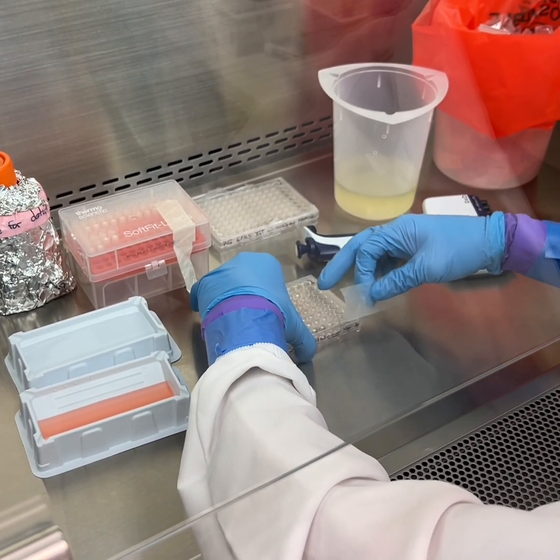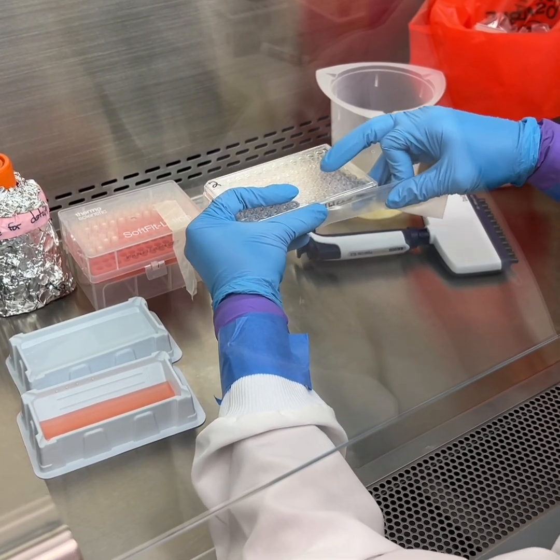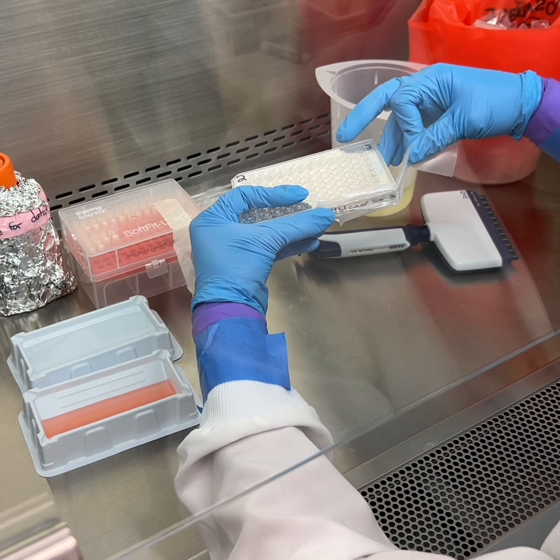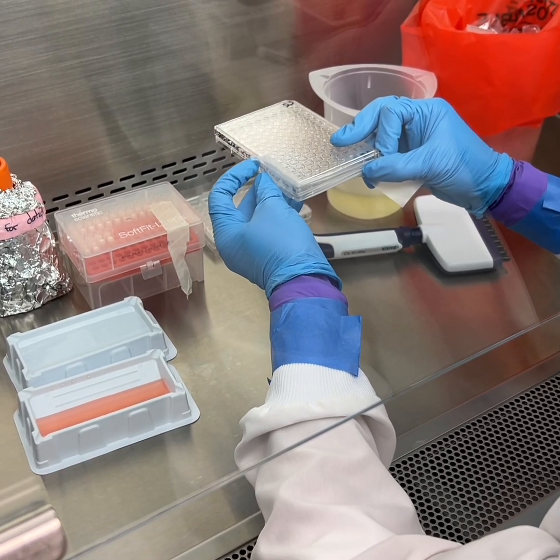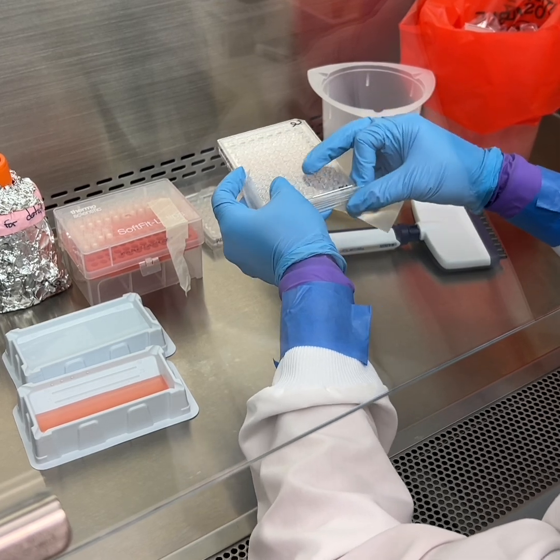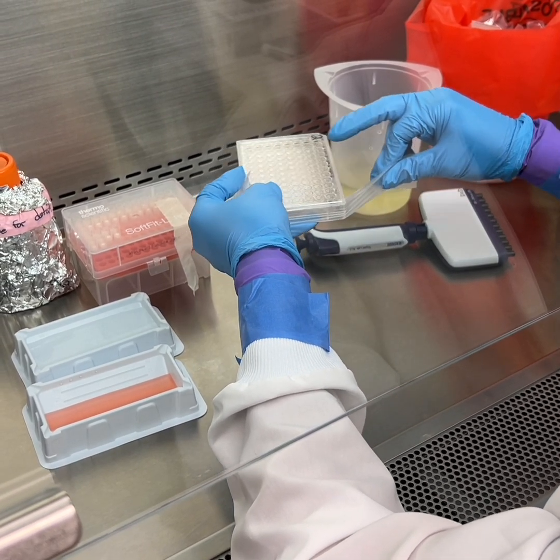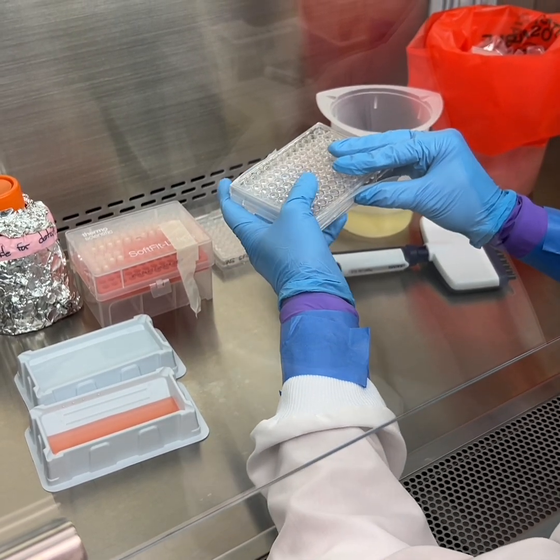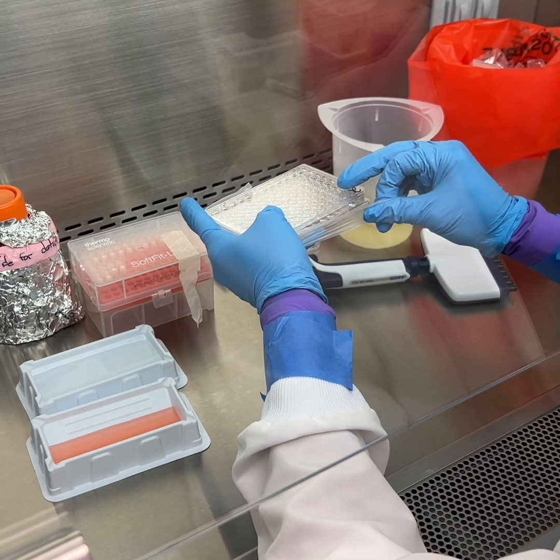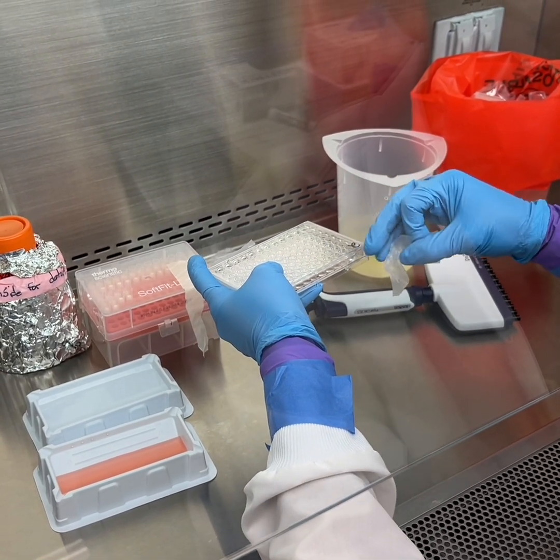And at this point, after you've covered it, you would be good to spray it off, hand it out to your assistant, do your other plates or whatever. Doff your gloves and come out of the hood. Uh-oh. It's okay, we'll just cut this.